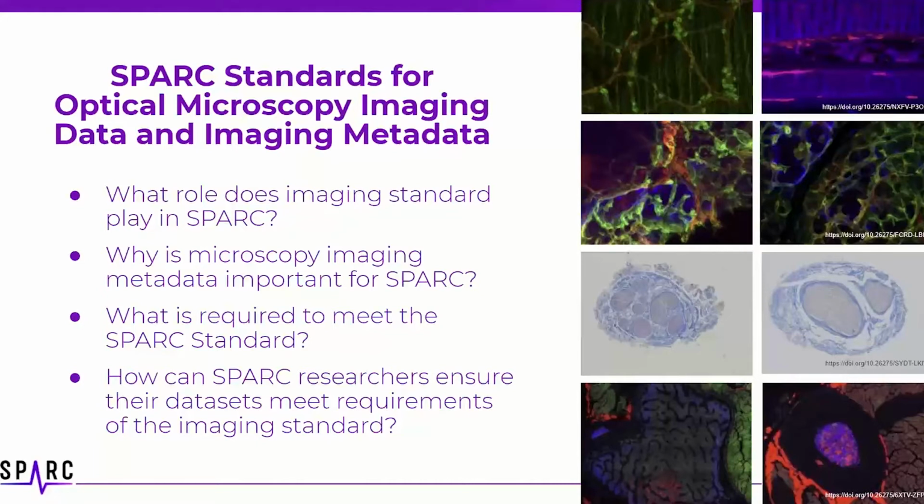Image files from many sources can be converted into JPEG 2000 or OME-TIFF formats that allow for efficient storage, viewing, and analysis. MicroFile Plus also allows for adding and editing essential metadata to ensure SPARC image data is FAIR, or findable, accessible, interoperable, and reusable.